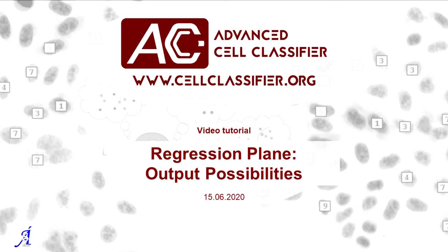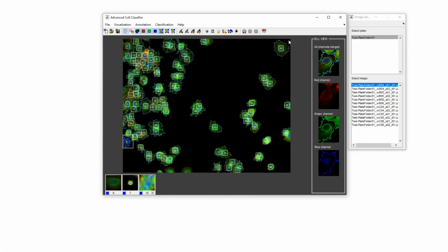Welcome! In this video tutorial, I will briefly describe the output possibilities of the Advanced Cell Classifier's regression plane. To obtain output from the regression plane, the user must have previously defined classes of interest with at least one regression class, some annotated cells in them, and a trained classifier.